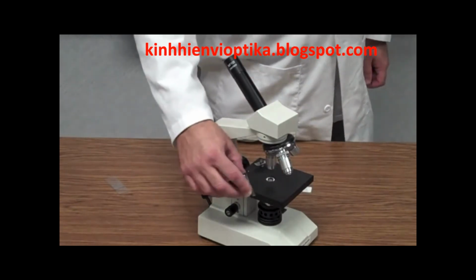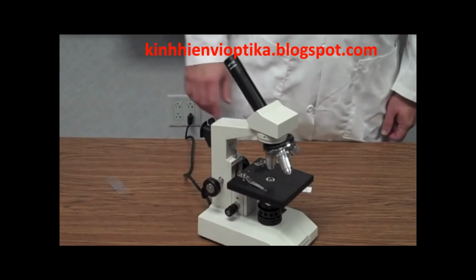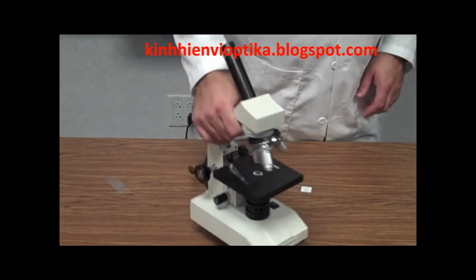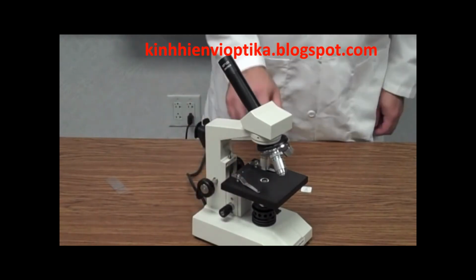On the stage you have these little metal clips. These are simply called stage clips. Okay, there are 2 stage clips, one on each side. They are used to hold the slide in place so it doesn't get bumped or accidentally knocked off.